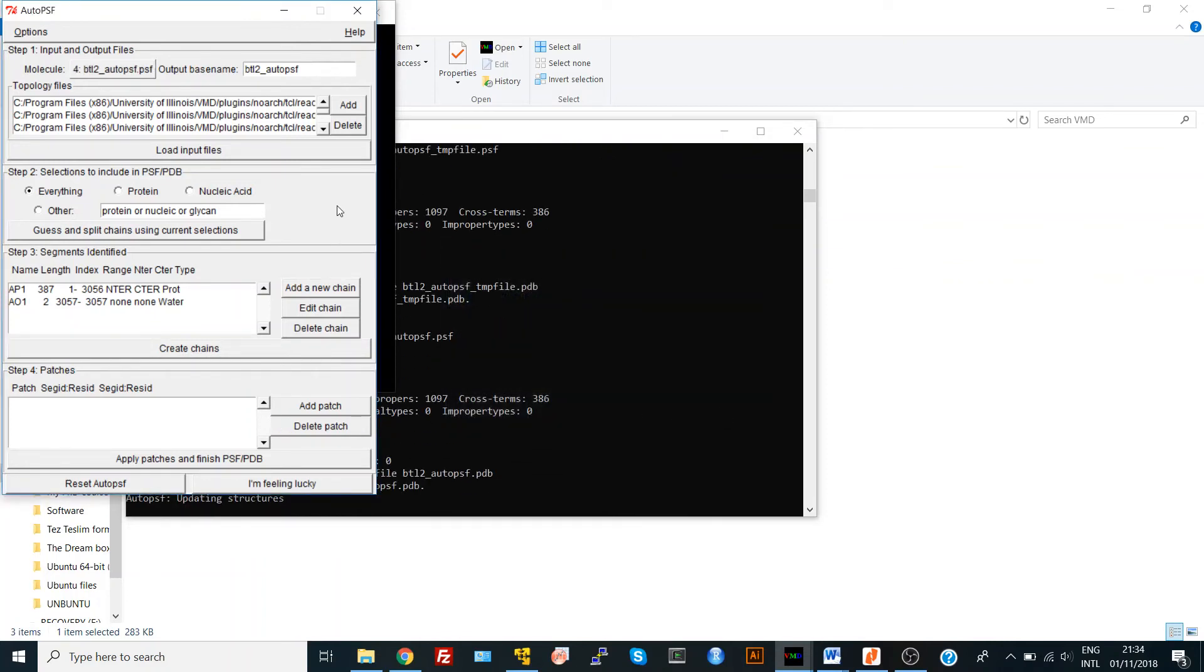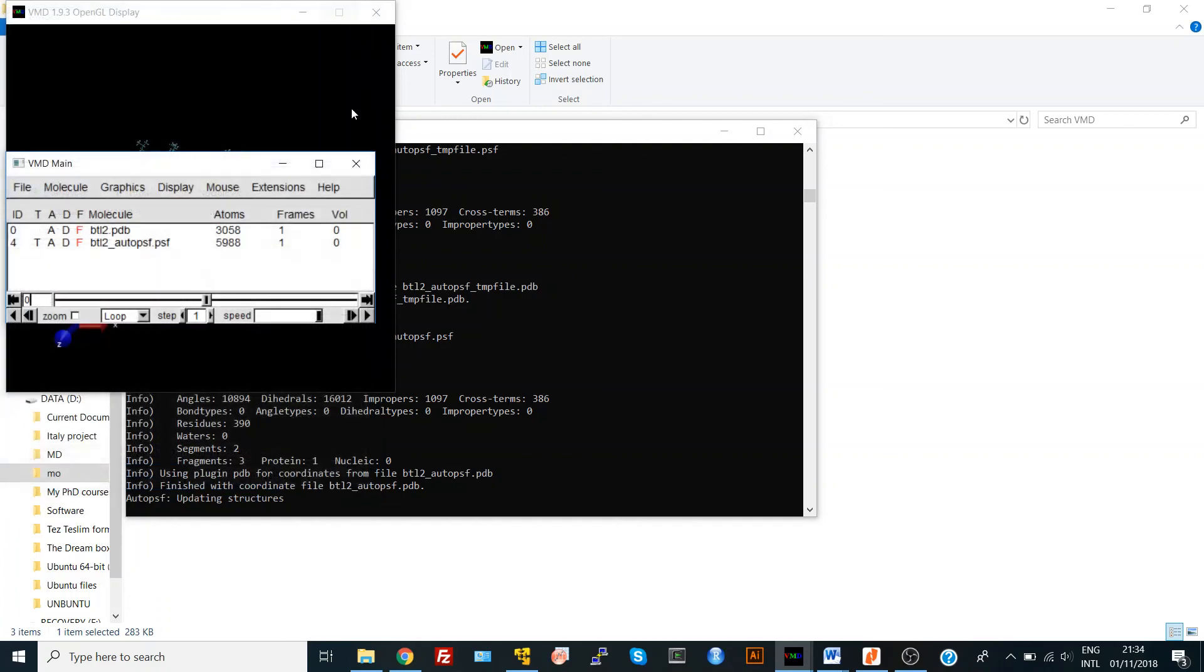Usually, if you want to avoid such errors, always run your VMD as administrator, or as sudo if you're using Ubuntu. That's it, thank you.